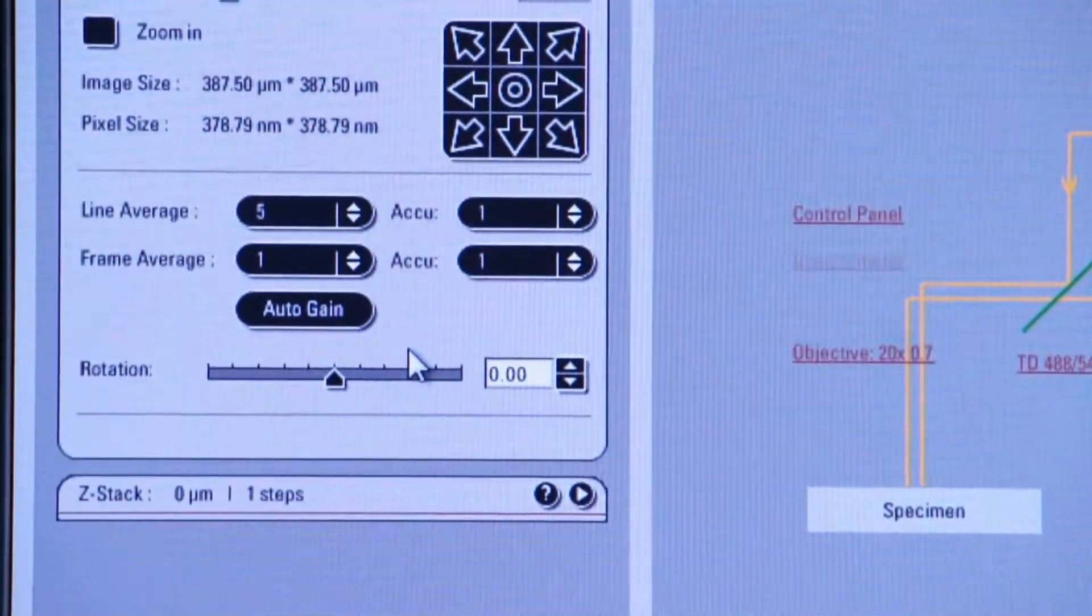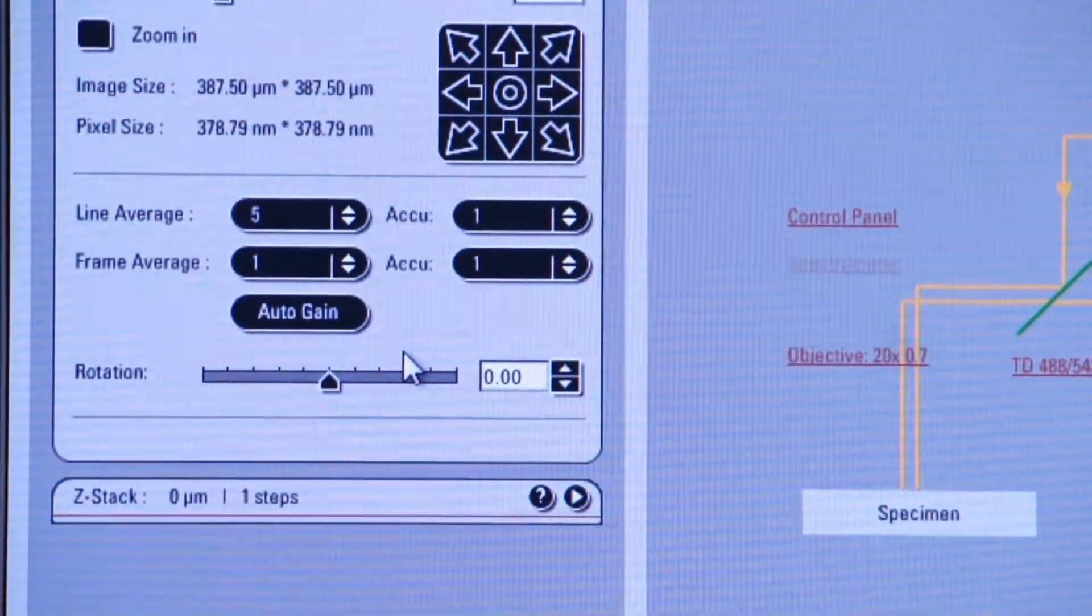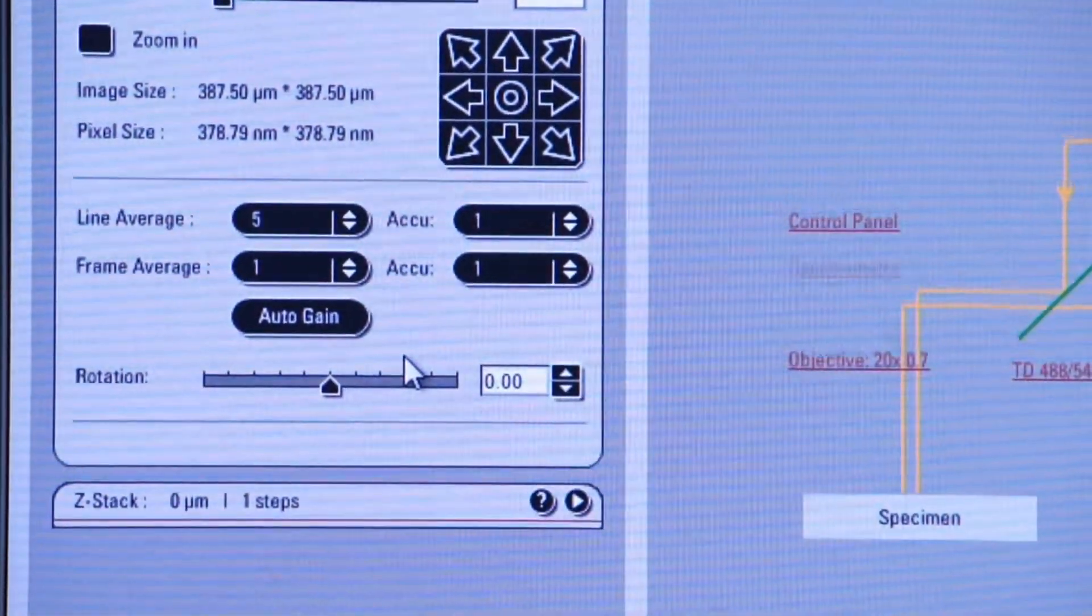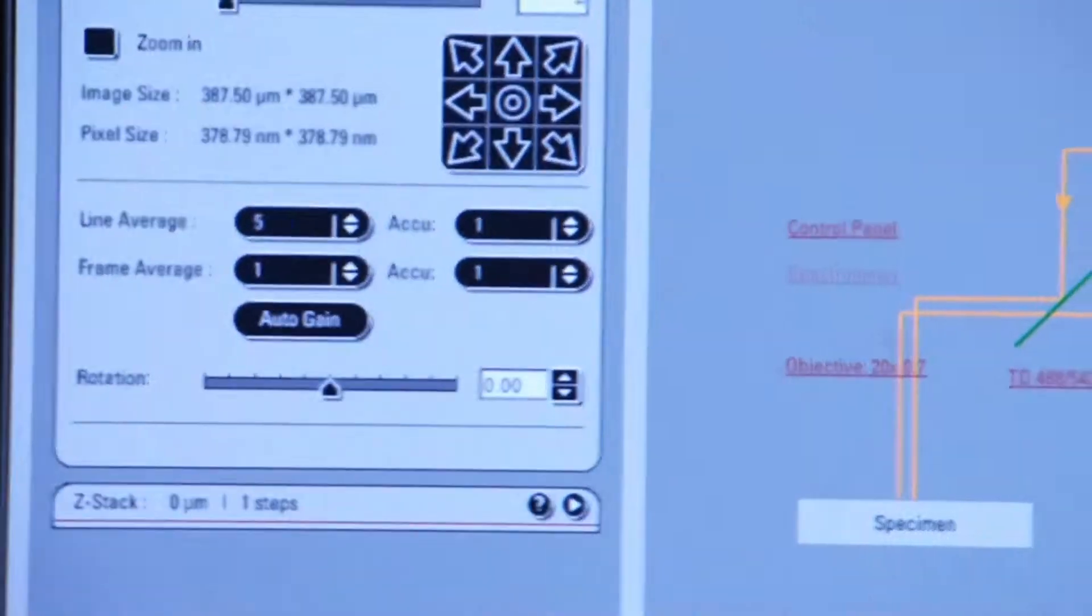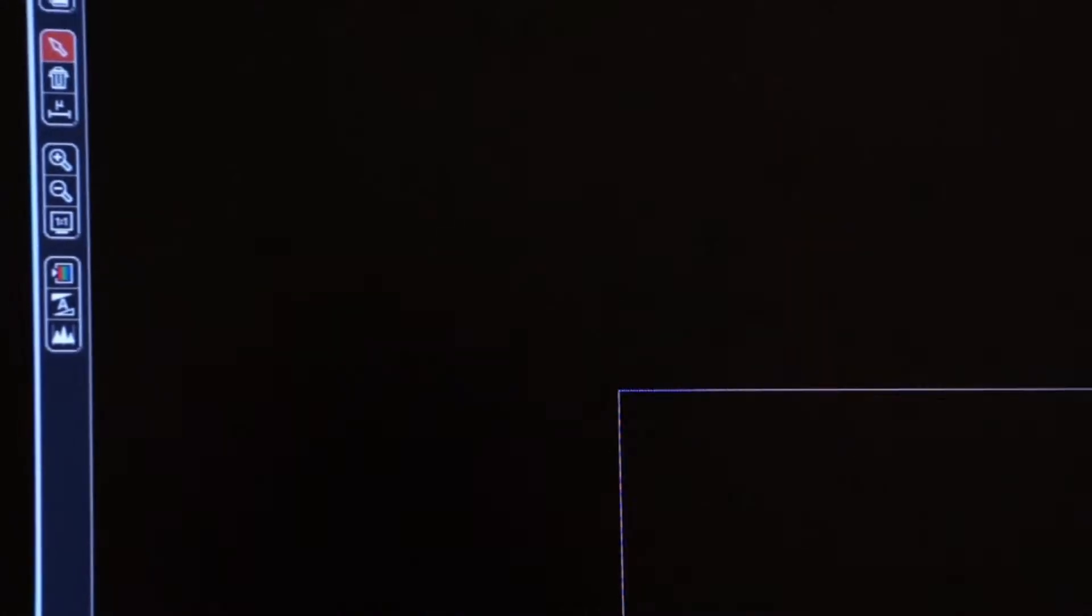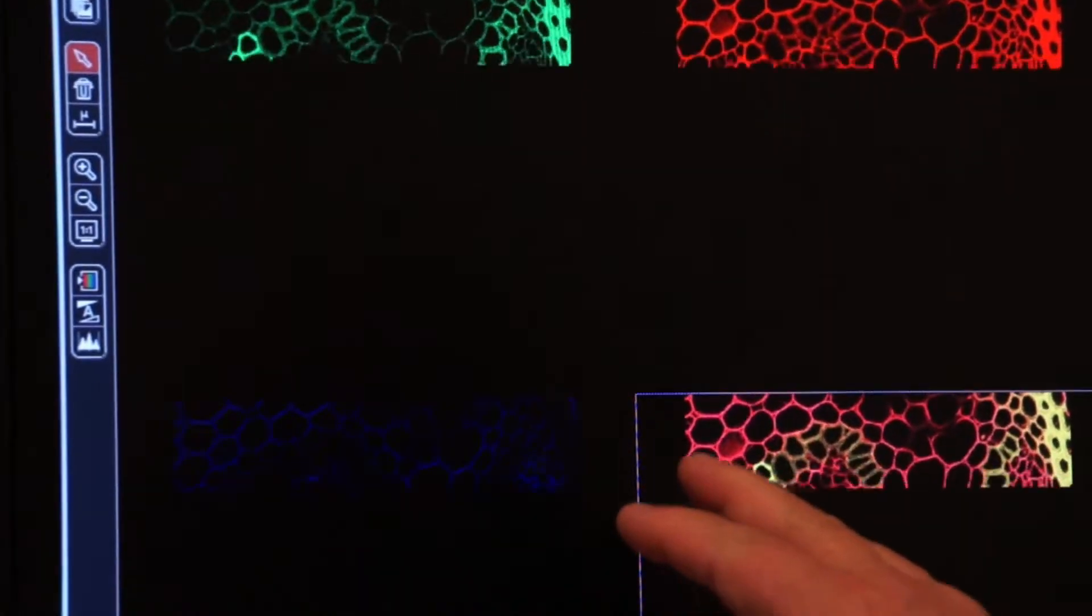Because we're scanning each line five times this will slow down. I'm going to click on capture an image and you can watch this screen here and you'll see the image being collected. Now you can see it's a little bit slower.